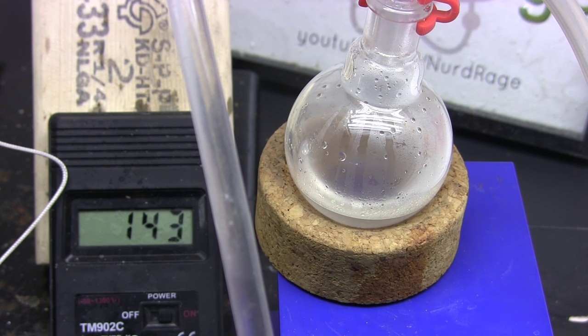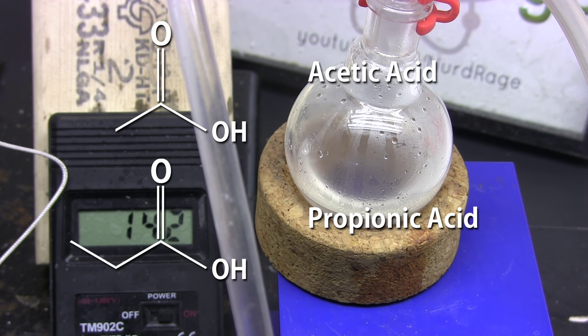Greetings fellow nerds. In this video we're going to make propionic acid. It's a carboxylic acid like the much more well-known acetic acid but has one additional carbon in its backbone. It's used to make solvents, fragrances, plastics, herbicides and other chemicals.